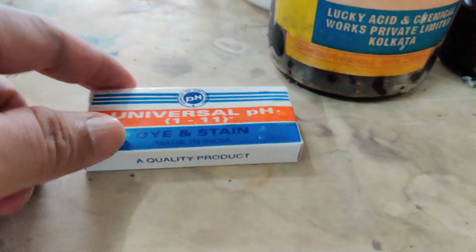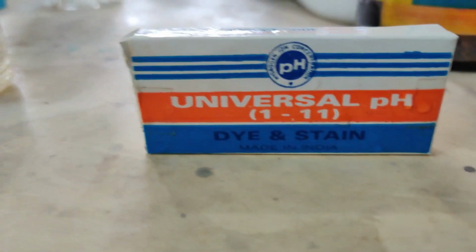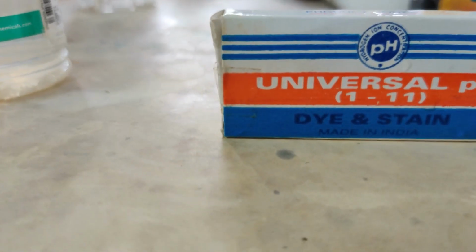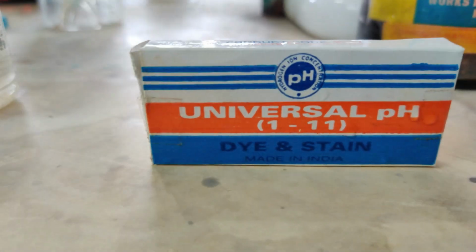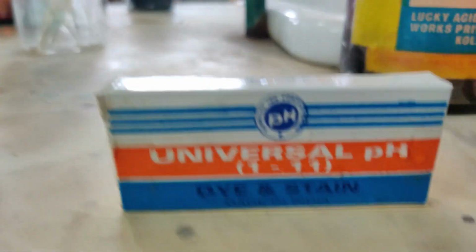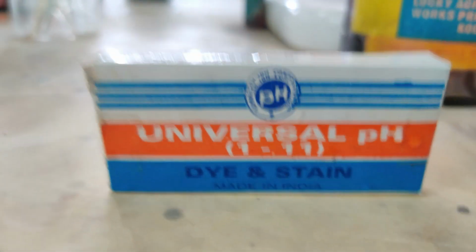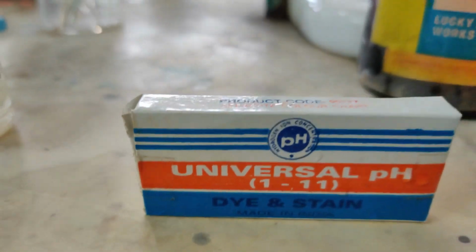Here it is. This is the paper. We have only the paper, we don't have the solution. This is the universal pH paper. In fact, universal pH is from 0 to 14, but the paper that we have in our lab can only measure from 1 to 11. Usually in laboratories you will have from 0 to 14. So you can see this is the pH paper I was talking about. That pH paper also I will show you how it looks from the inside.